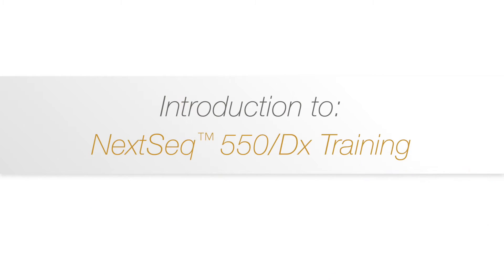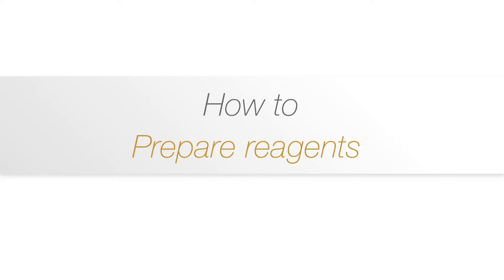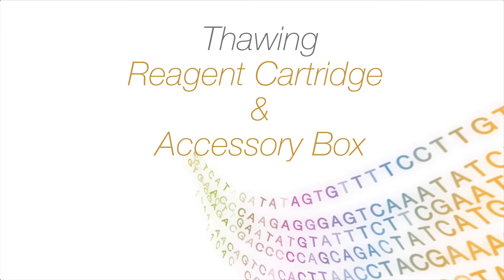Welcome to the introduction series to the NexSeq 550 550DX training. This movie clip will show you the steps to take to prepare reagents before a sequencing run on the NexSeq — specifically how to prepare the reagent cartridge and the accessory box.